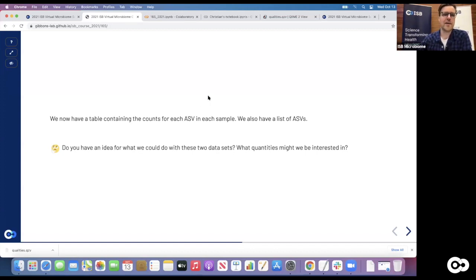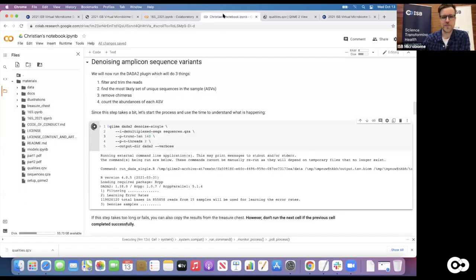So if I see 100 different unique amplicon sequences in a single sample after we run DADA2, but I only see 2 in another sample, that goes into a question of diversity, definitely. And variability is also a really good question. Why is one ASV in one sample and not in the other? That means it's fairly specific. So maybe it belongs to an organism that only thrives in a particular environment.